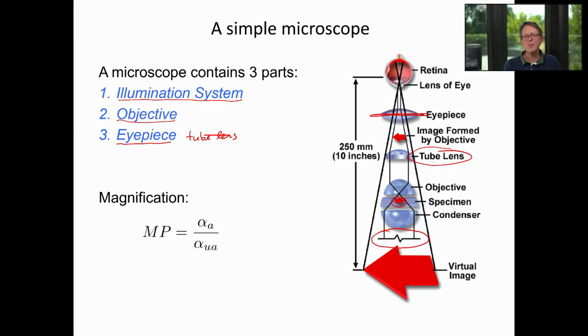In simple microscopes that you use in laboratory use, where you use your eye to capture the image, you also have an eyepiece sometimes in there, the oculars that you put in on the microscope. And they're really just to take the intermediate image here formed by the tube lens, and magnify it further so you can visualize it in the eye.